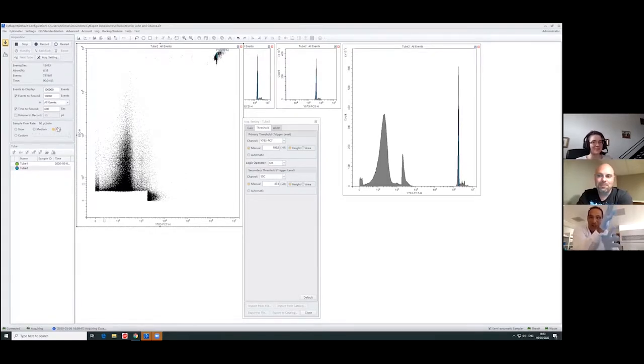So I go as slow as I can. But if I put this floating around here, imagine the swarming effect that you're generating. If I can see this effect in 2.5 micron beads, imagine the same effect in microvesicles or EVs. You have a cloud of them floating around. So it's really important not just to look at the abort rate, but also at what the effect is when you're changing this. And this is something we'll play with on the controls as well, and we'll dilute and see how this is affecting things as well.